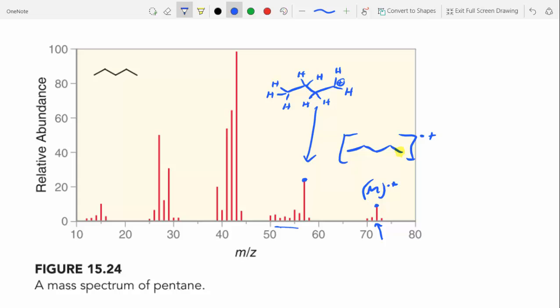What do you think these pieces are at the slightly lower level? Yeah, hydrogens being popped off. So we could knock off individual hydrogens off of that butane fragment, and we could see those too. However, the biggest peak usually corresponds to the most predominant fragment in the sample. All right, so now let's take a look at this next one.